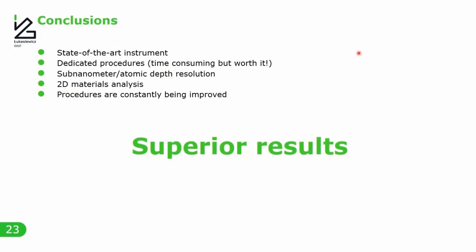And in this way, we can really reach the sub-nanometer or even atomic depth resolution during the SIMS analysis, which enables 2D materials characterizations. I may also, at the end, conclude that please remember that I'm not giving up yet.